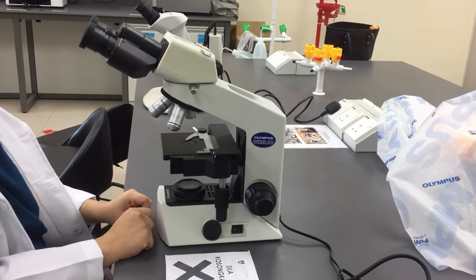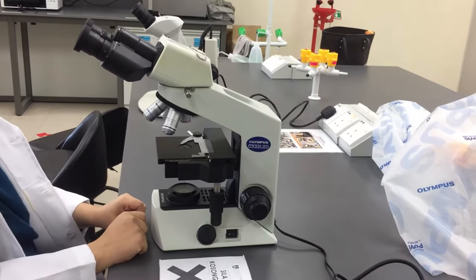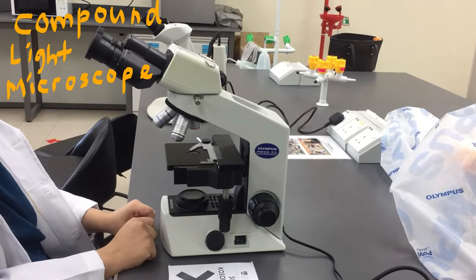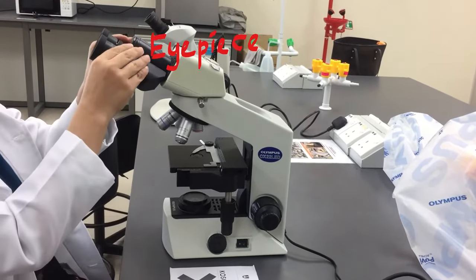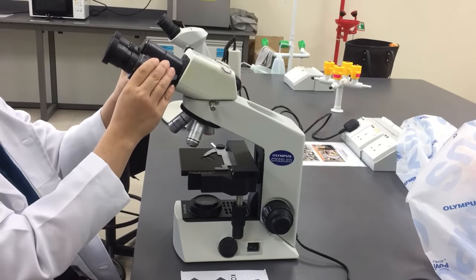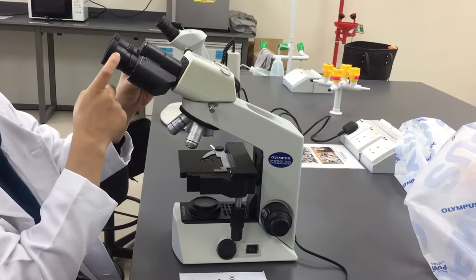Assalamualaikum and hi everyone. Today I'm going to show you the Light Compound Microscope. The first part of the Light Compound Microscope is the eyepiece or the ocular lens. The ocular lens will give you 10 times magnification.